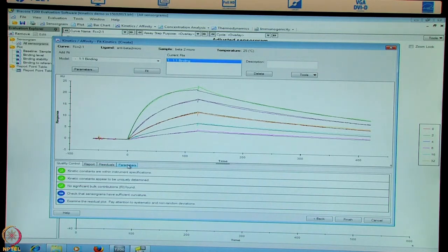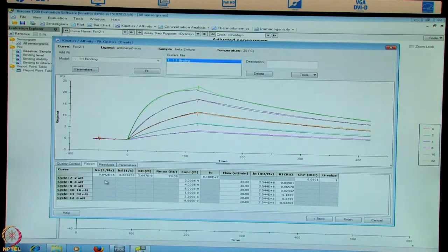Each of them has data from this experiment. To start with, we go on to the quality control tab and see here all the three are in green with kinetic constants within instrument specifications, uniquely determined, and no bulk contributions found. We have learned from our theoretical sessions, bulk contributions will be more if there is a mismatch between buffer and sample.